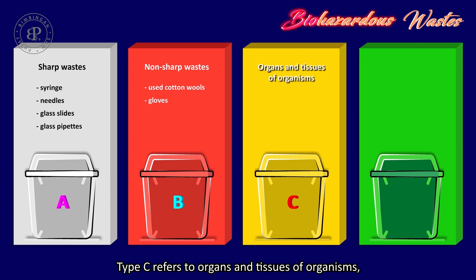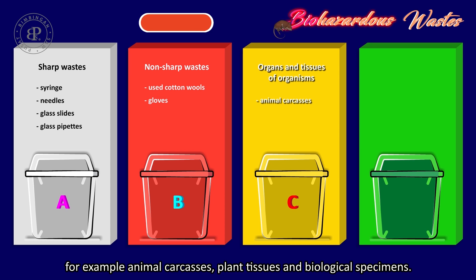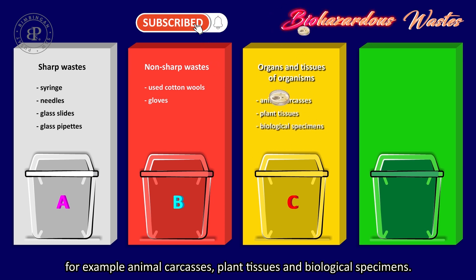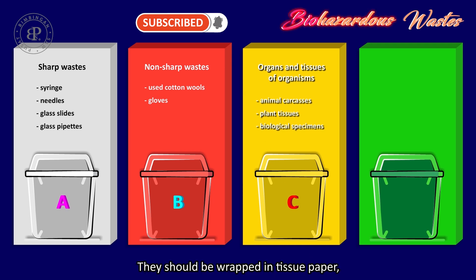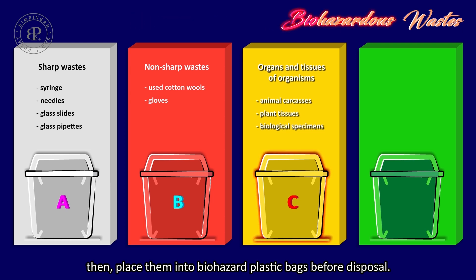Type C refers to organs and tissues of organisms, for example animal carcasses, plant tissues and biological specimens. They should be wrapped in tissue paper, then placed into biohazard plastic bags before disposal.